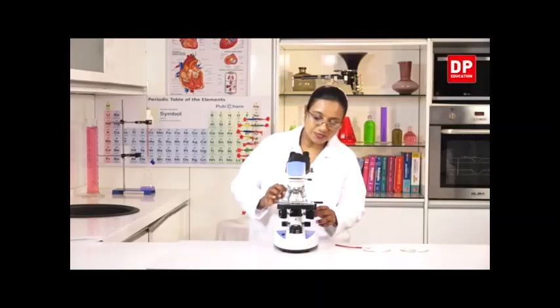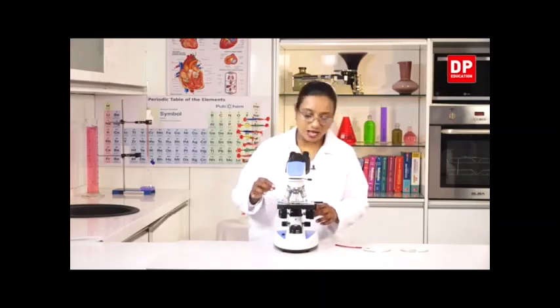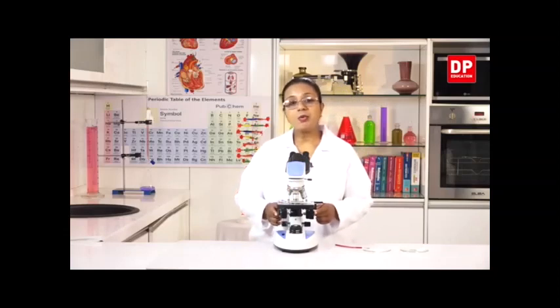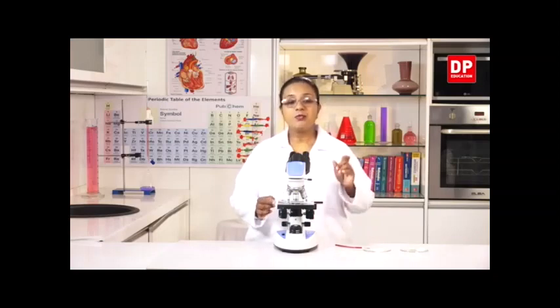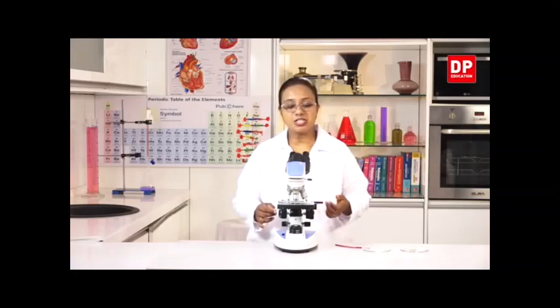Once you observe that, we can change the power of the lens to a higher power. I will do that now. And then with the high power, we don't use the coarse adjustment knob. What is the knob we are supposed to use? Yes, it is the fine adjustment knob. By adjusting the fine adjustment knob, we can clearly observe the cells present in a specimen of the cheek. So we will be observing the cheek cells.